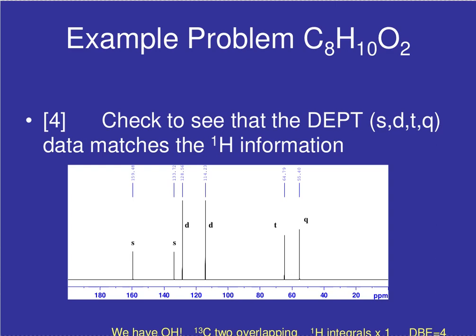right. So one other piece of information we can work with is the DEPT information, the multiplicity here. So we can count how many protons that accounts for. For example, we know this quartet is a CH3, which means that in the carbon we've got information about 3 hydrogens. Over here it's a CH2, so we've got information about 2 hydrogens. So it's interesting that this carbon-13 spectrum is going to show how many hydrogens are attached to carbon in this molecule. And if we count them, you'll see that there are 3, 4, 5. Remember, this is doubling up. 6, 7, 8, 9, and there are no hydrogens attached here. So this spectrum shows that there are 9 protons attached to carbon in the molecule.